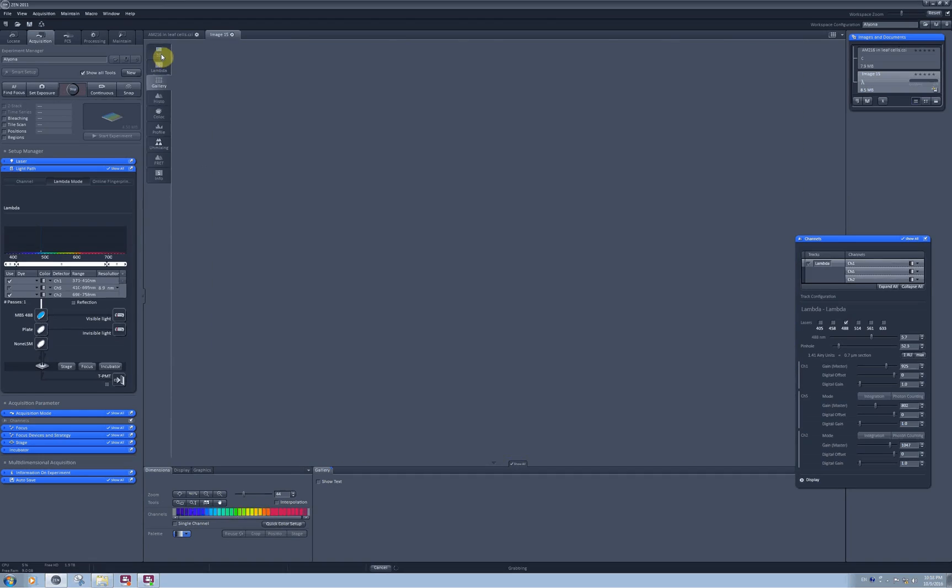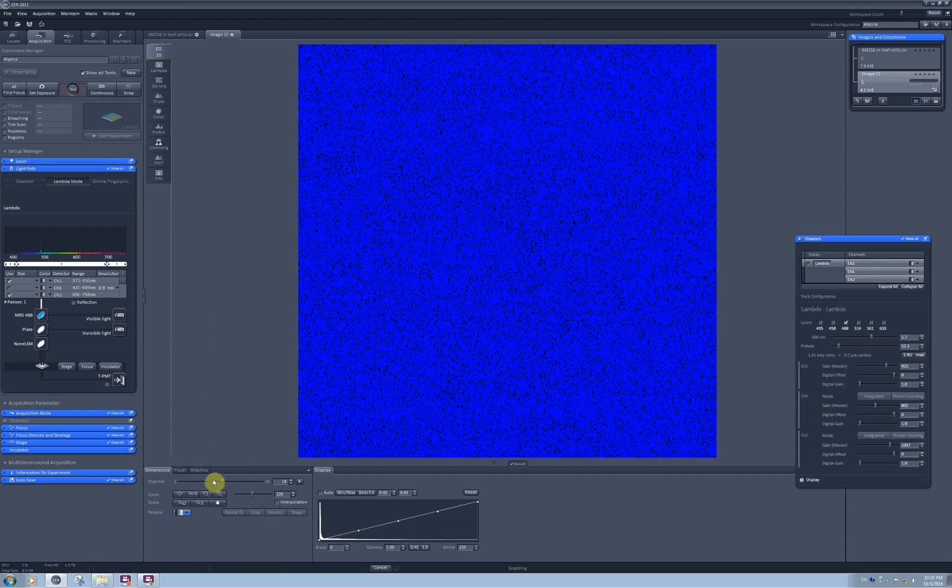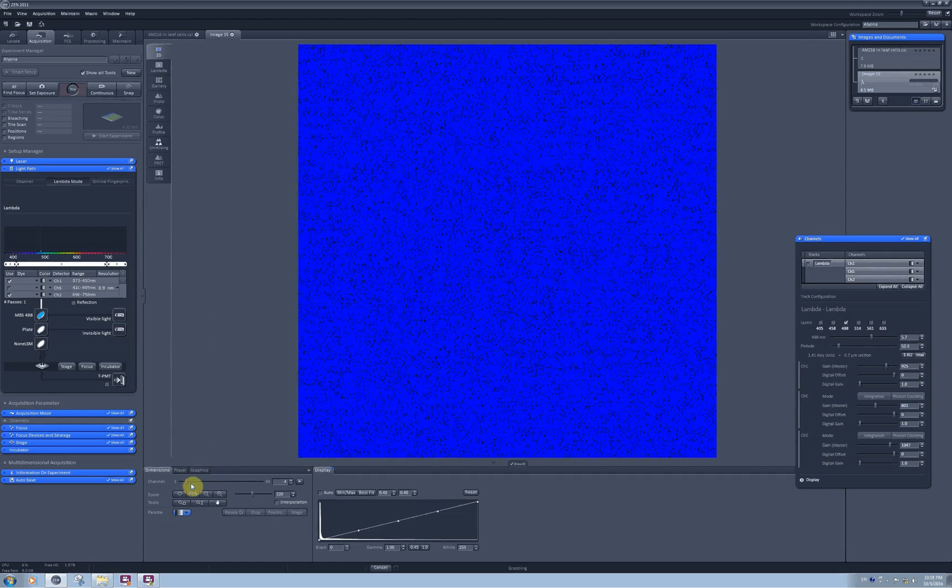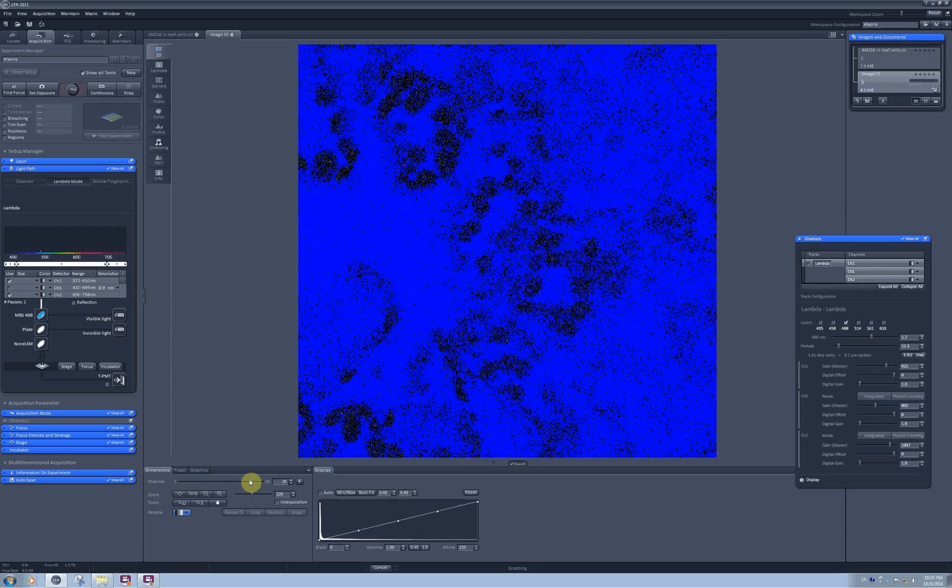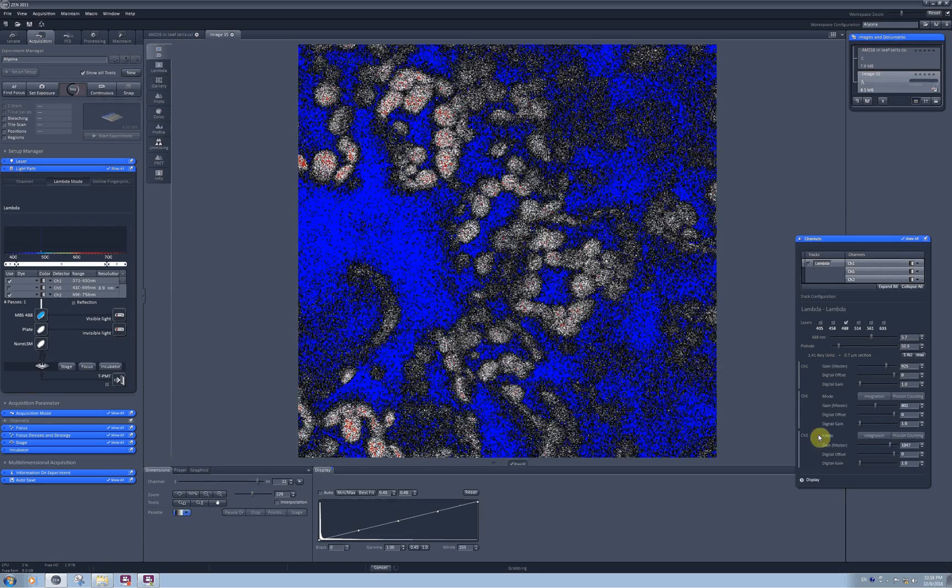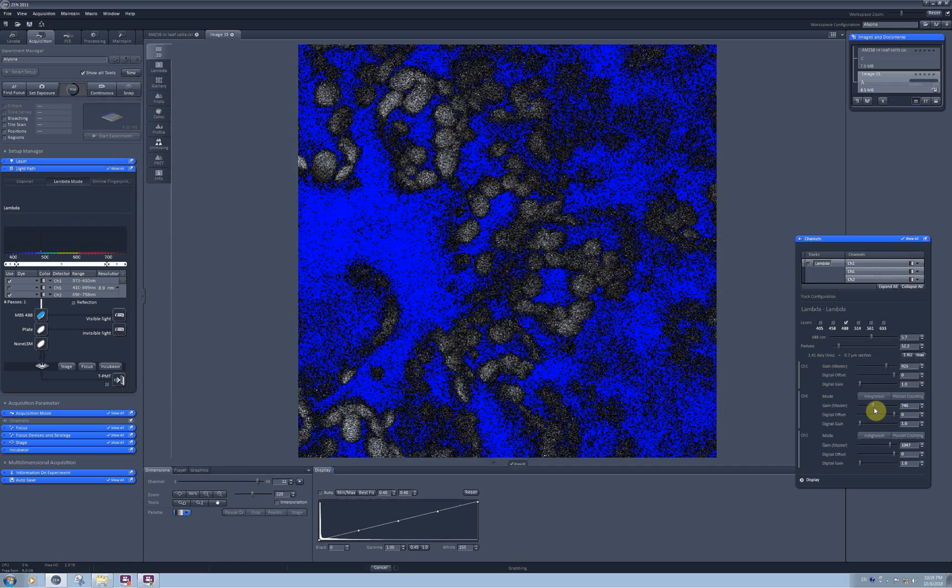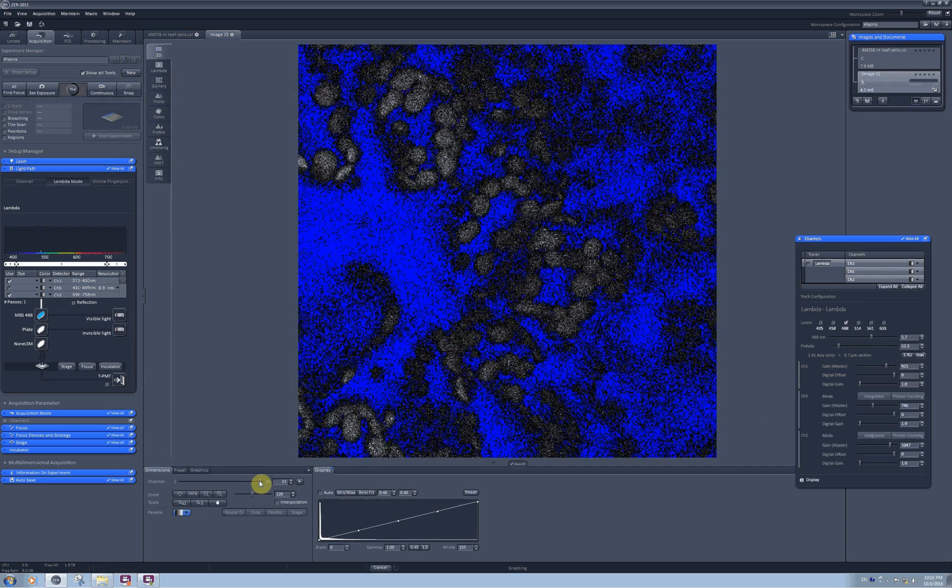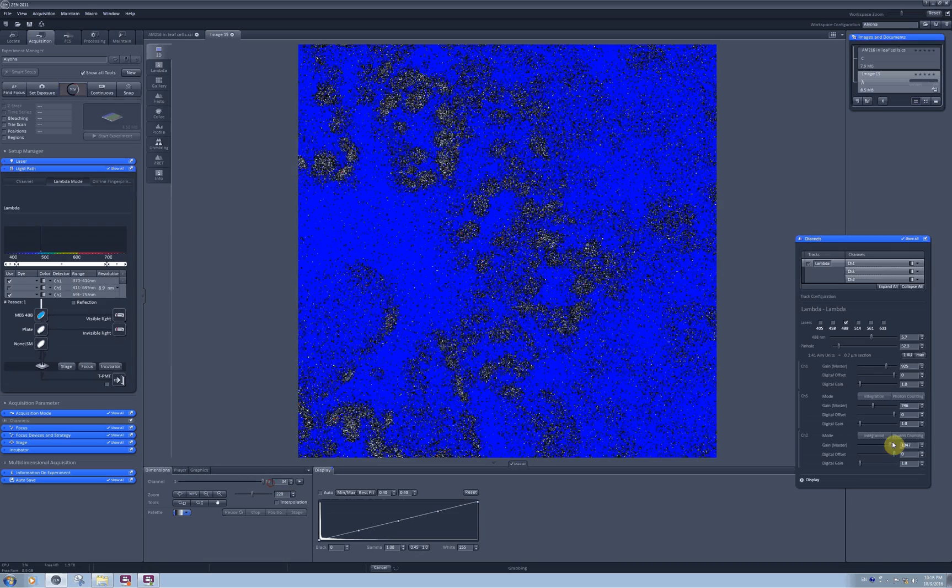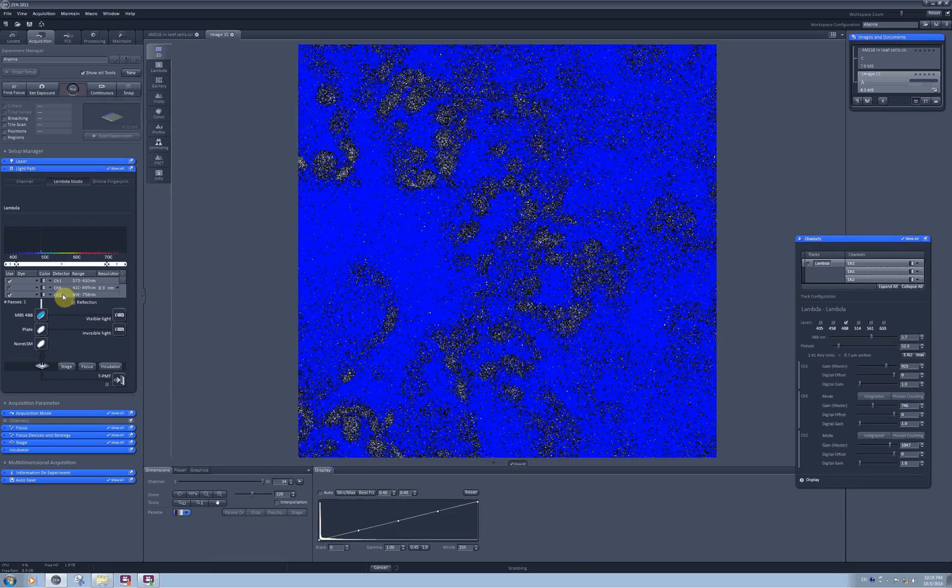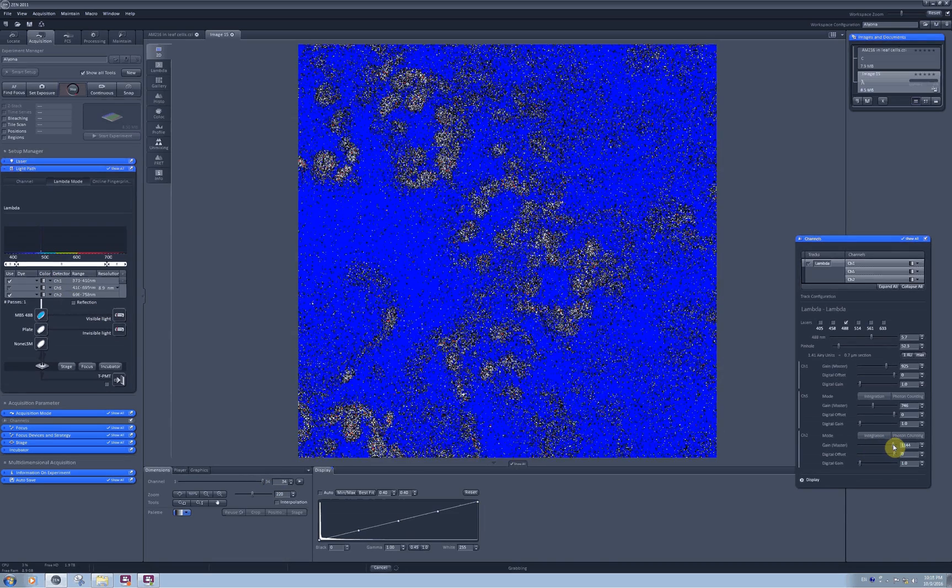To be able to see it easier you can go to the 2D tab and then just scroll between the channels. So here is the chlorophyll showing up and it's a little bit oversaturated. And on the detector G2 I also can see some chlorophyll.